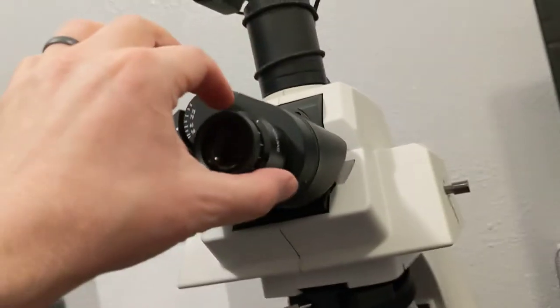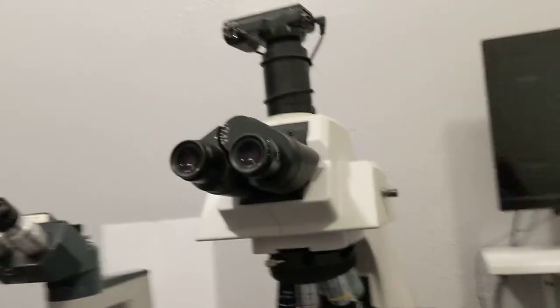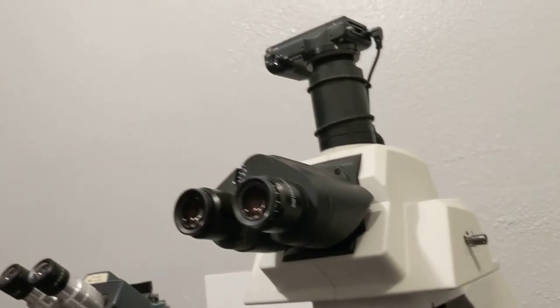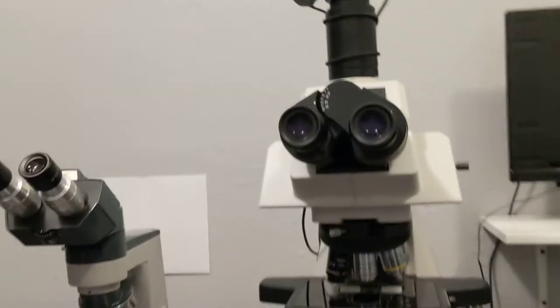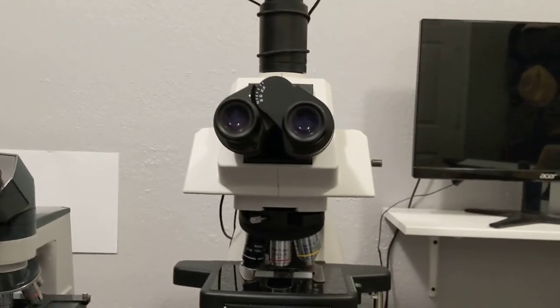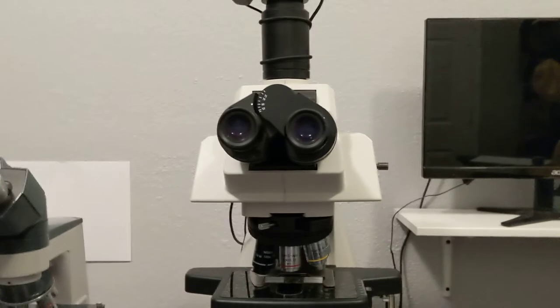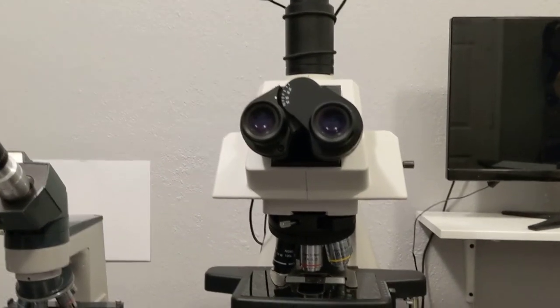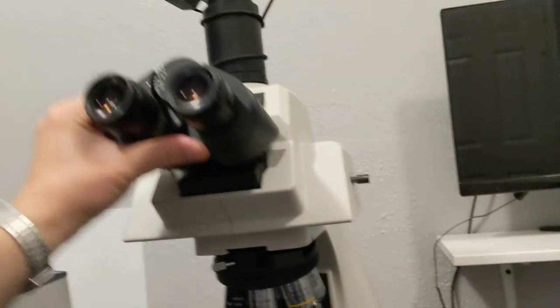I really like these eyepieces. How important is this 25-millimeter field of view? If I take my 22-millimeter field of view oculars and put them in here, there's a difference, but it's not a ton. You don't really notice it that much. But this is kind of the ultimate, as far as the field of view can go.